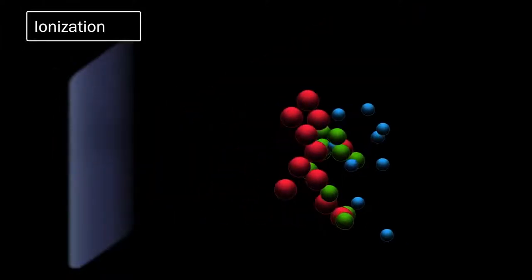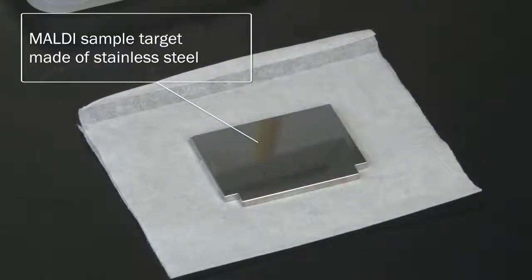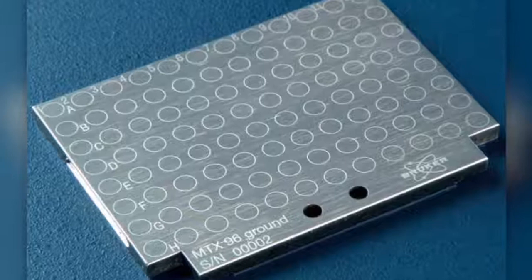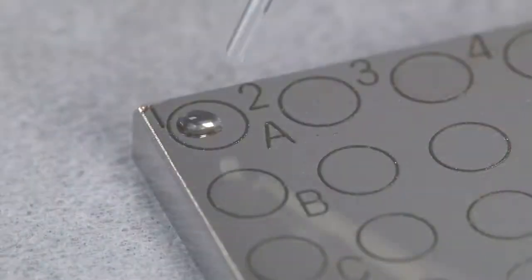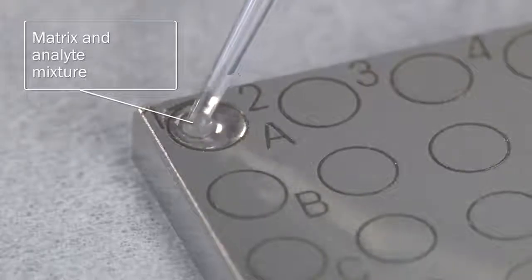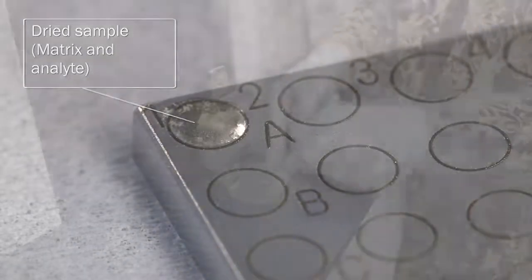into the gas phase. Solutions of the matrix and analyte are deposited onto a sample plate known as the target. The target can be made of polished or ground stainless steel and has spots for several different samples to be applied. The solvent is allowed to evaporate from the sample solution, leaving behind a solid sample spot on the target that will be analyzed by the MALDI TOF spectrometer.